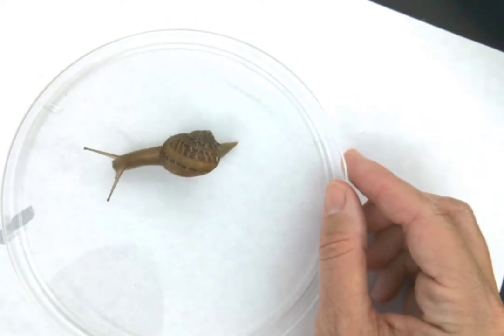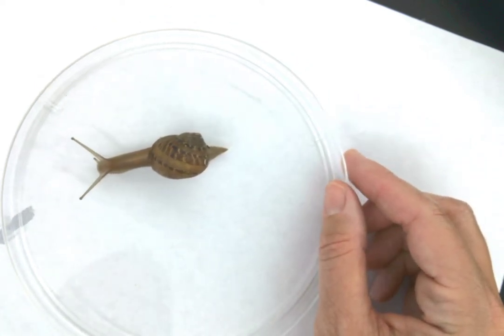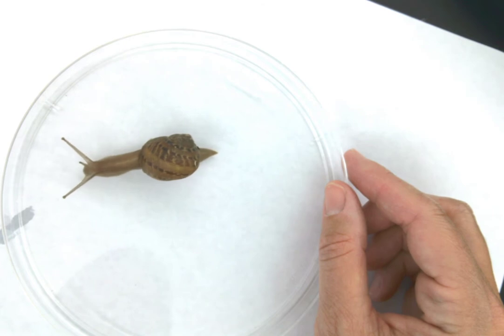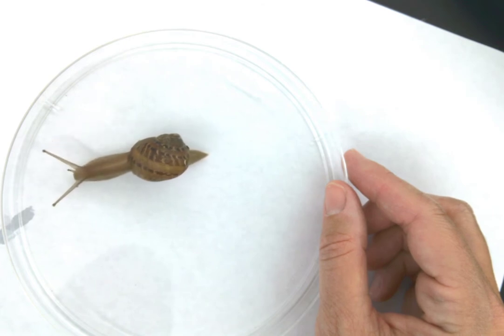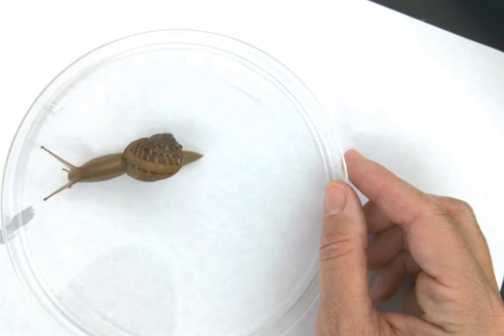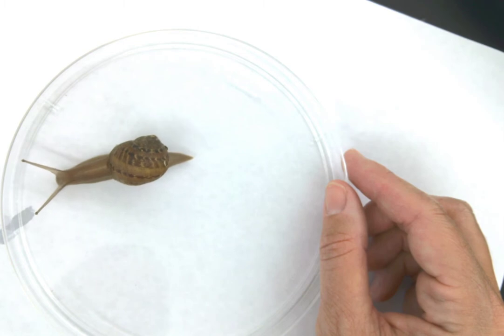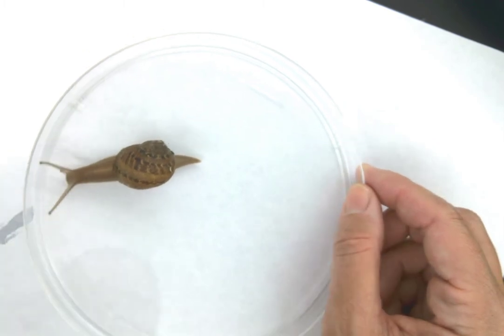Moving on to page 11. This is Procedure B, number 3. It says: as you observe the snail, suggest structures and behaviors that might protect it from predators.